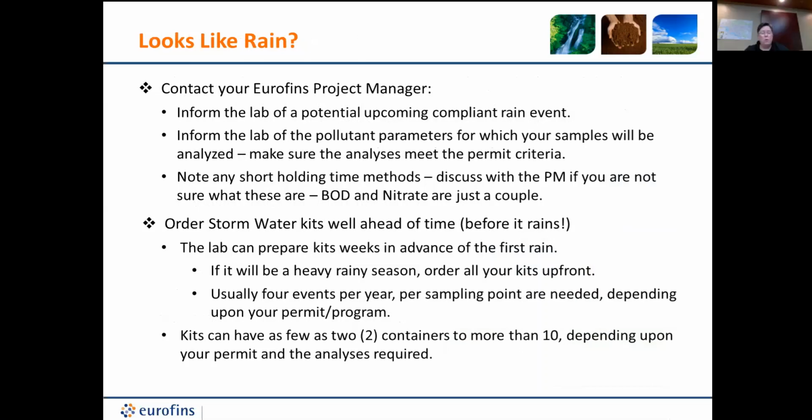We would like you to request that. Like I said, we're going to report to the reporting limit, but if you need to report the MDL, let us know that. It's not a problem. Okay, so putting an MDL on the reports isn't an automatic thing? It is not. It's however you want your project set up.